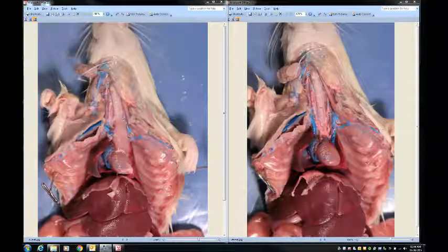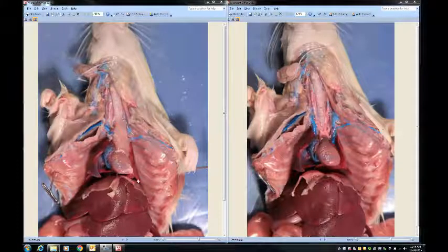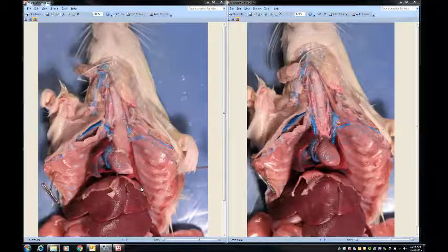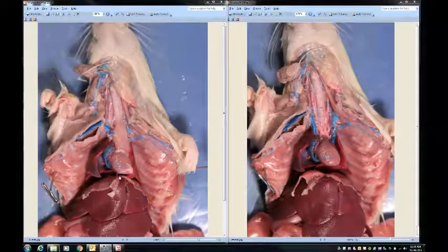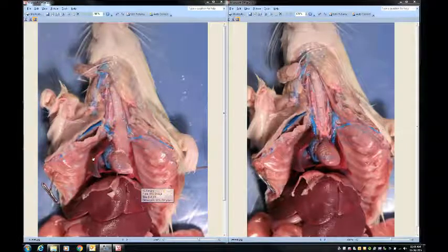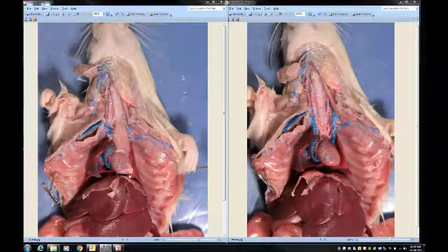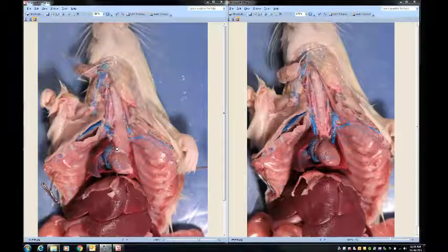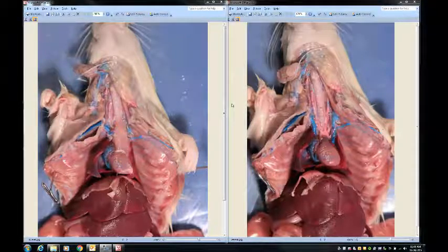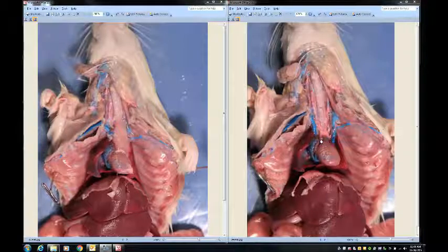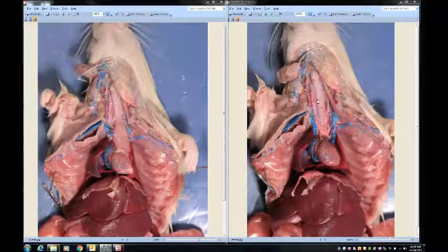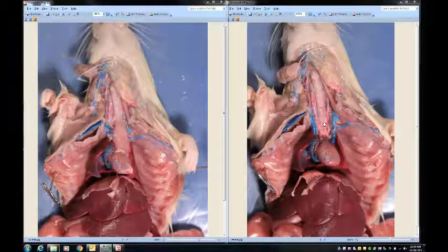We'll start in the thoracic cavity of the rat, which is the top portion above the diaphragm. Going through these images, this flimsy-looking muscle is the diaphragm itself. Here you've got a lung, and this dark red piece is another lung. Both surround the heart. In this rat you have a gland called the thymus, which has been removed in the picture on the right so you can better see the top portion of the heart and also the trachea. If you look closely at the trachea, you can see these little rings — those are cartilage rings that help keep the trachea open so air can flow into the lungs.